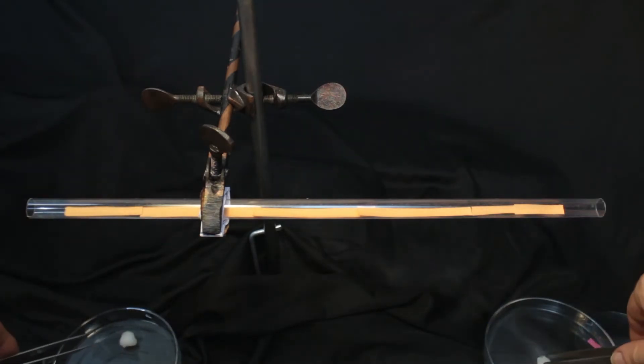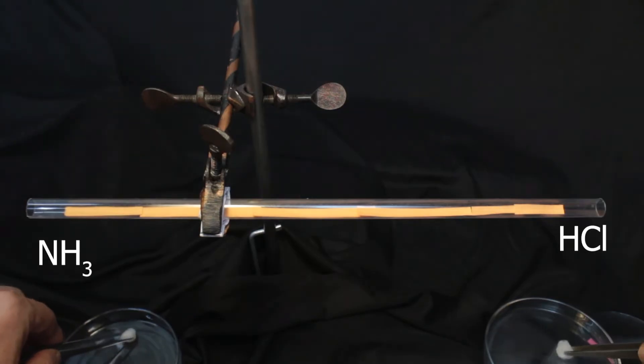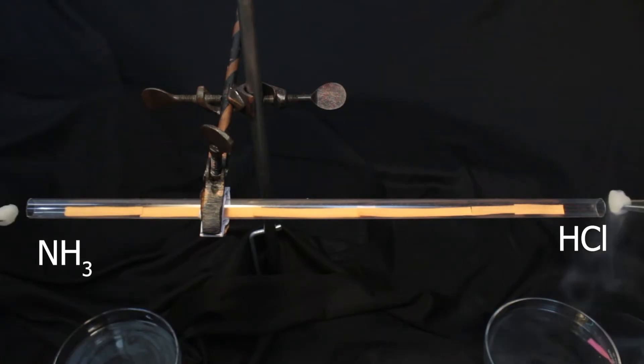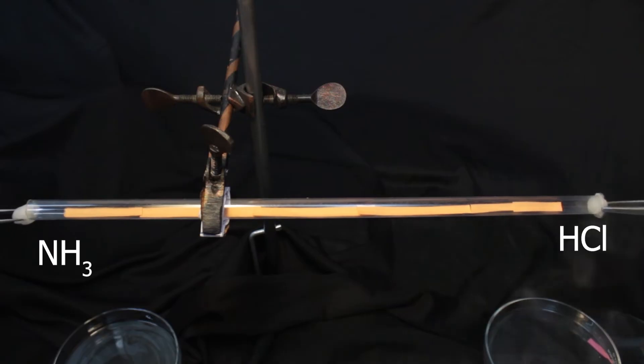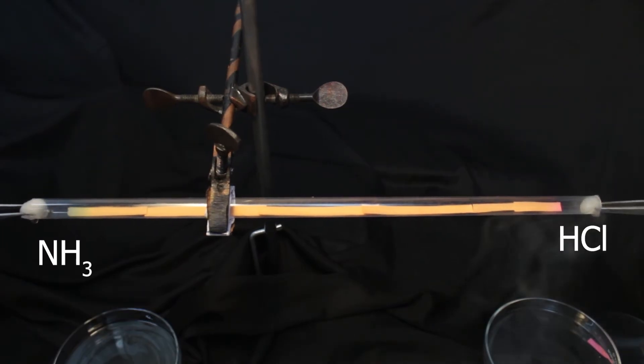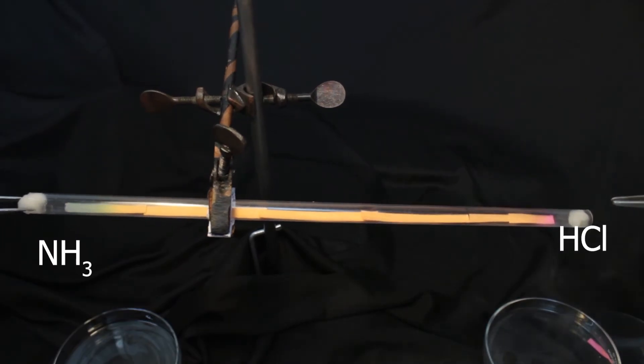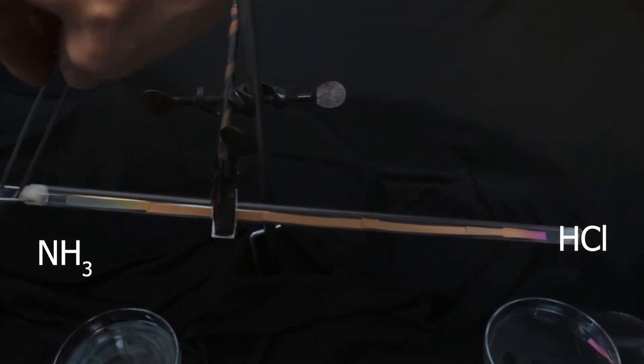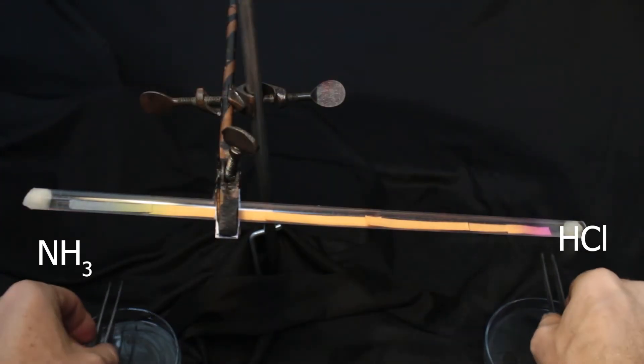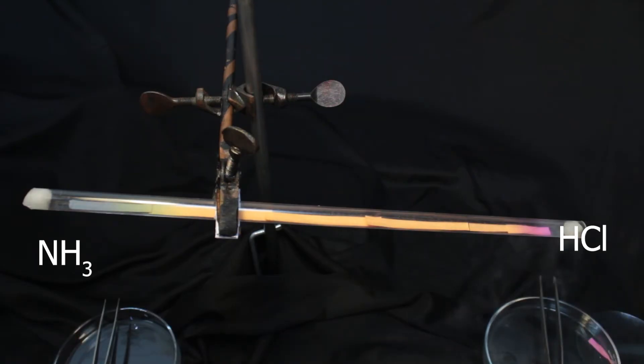Also, there is one idea that lighter molecules move faster at a given temperature. Relative formula mass of ammonia is 17, relative formula mass of hydrogen chloride is 36.5. It is about two times heavier, so it's supposed to move a bit slower.